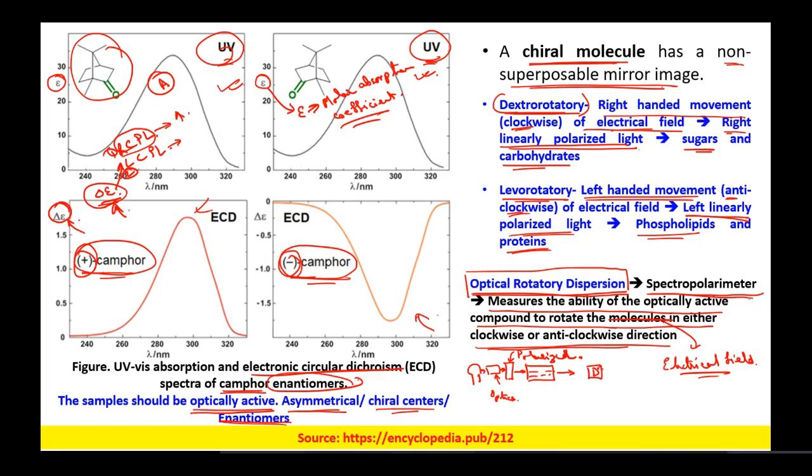Okay. Now this detector detects whether the light has been moved in a clockwise direction or in the anti-clockwise direction. So how do you do this? You do this by inserting another polarizer, but we do not call it a polarizer, we call it an analyzer. Okay.